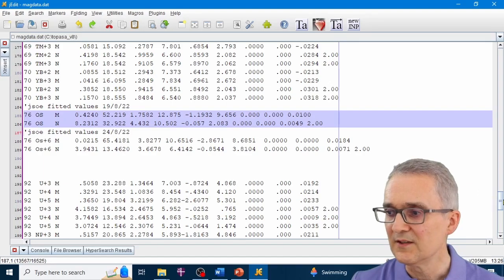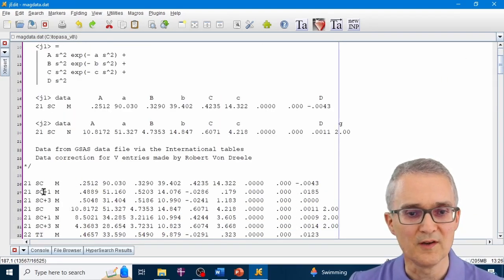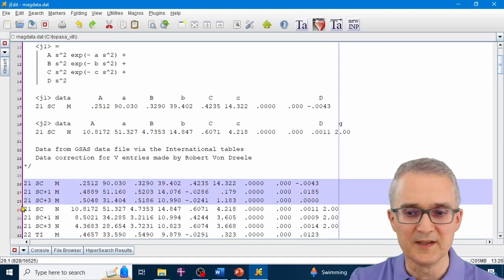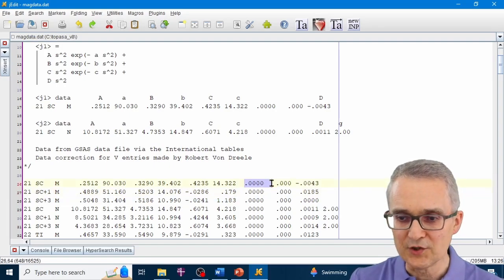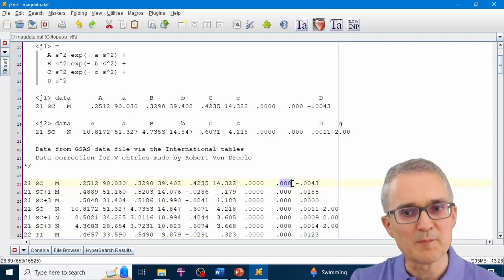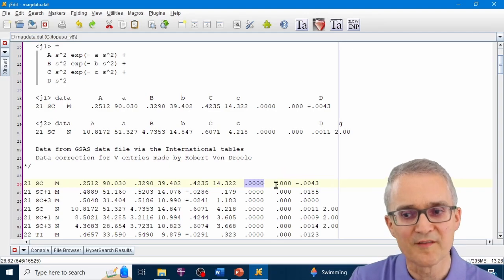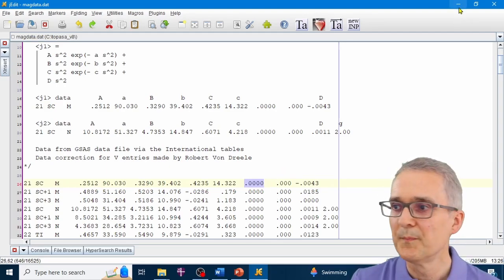If you do ever need to do that, just be a little bit careful and make sure that you follow the Topas way of describing these form factors. It uses 7 coefficients, and there are actually 2 coefficients in the equations that used to have to be 0. There are some 9 parameter descriptions of magnetic scattering factors in the literature, so make sure you don't put the wrong values into these columns or all of your calculations will be wrong.